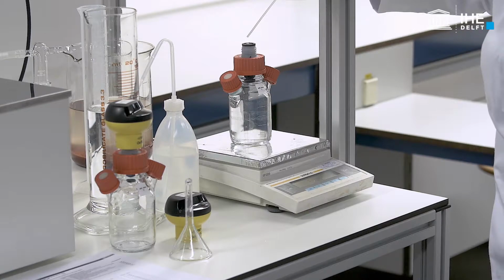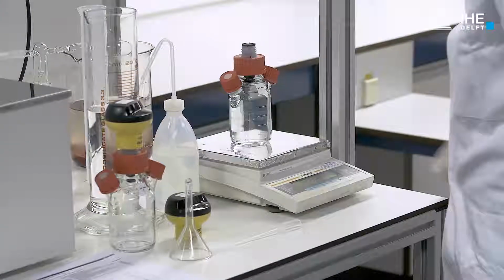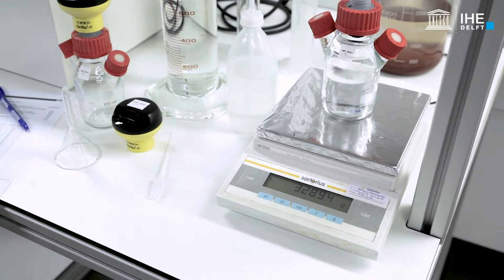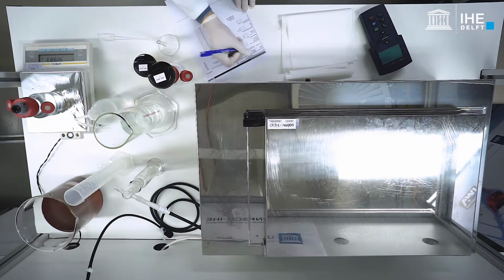The final weight in grams will correspond to the actual working volume expressed in millilitres. Write down the net working volume of the reactor.